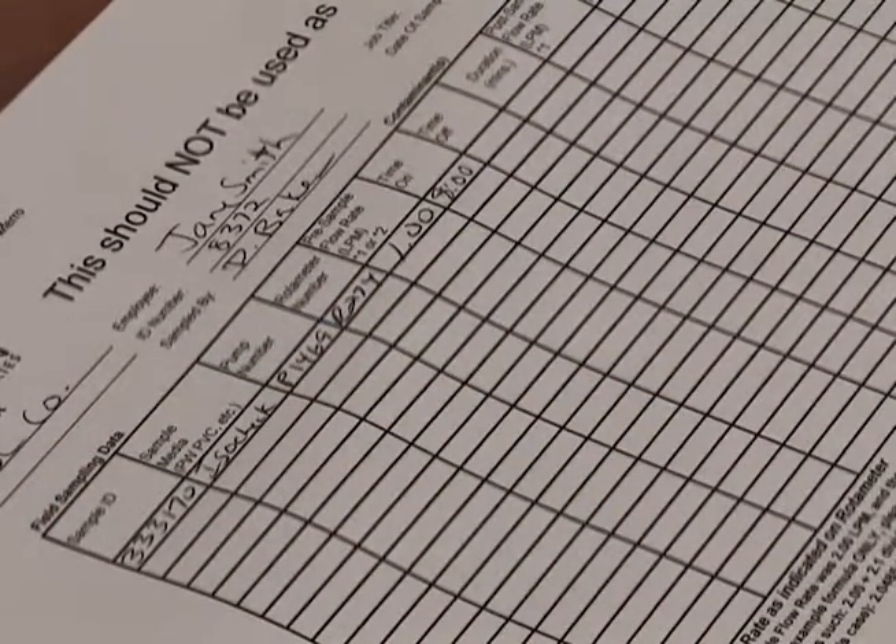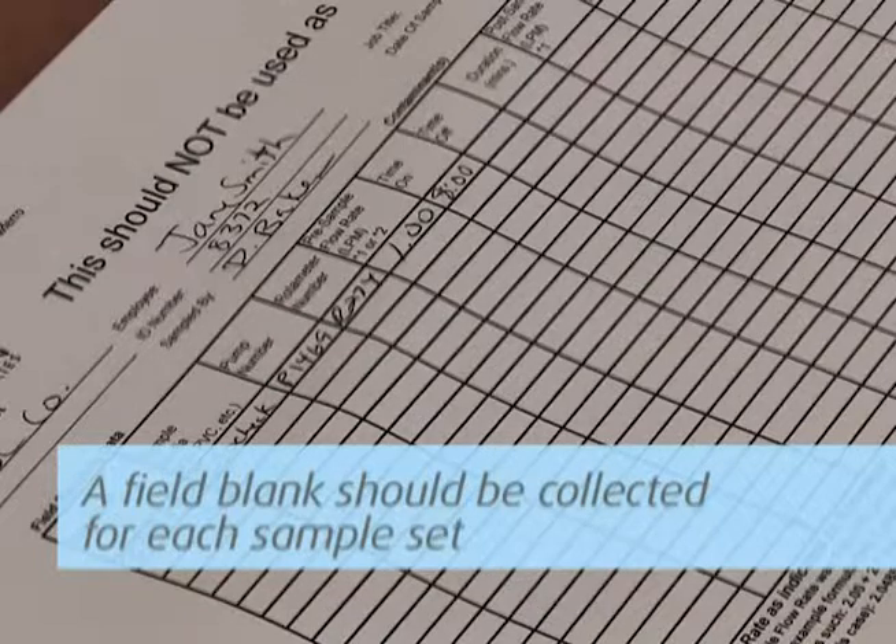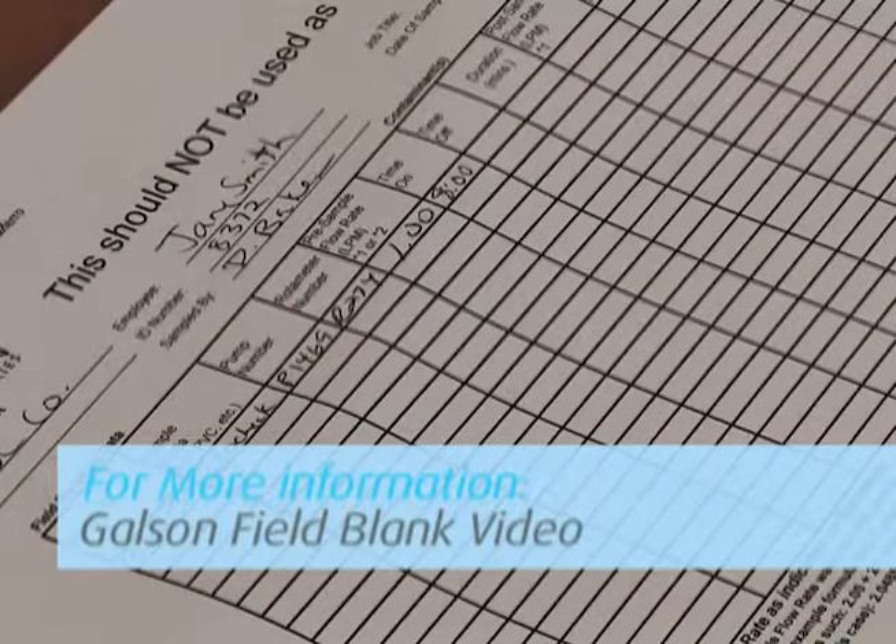The counter records the minutes the pump is operating and should read 0 when you start the test. Remember, a field blank cassette should be collected for each sample set and should accompany the actual sampling cassettes during all periods except actual sampling. For more detailed information, watch our field blanks video.